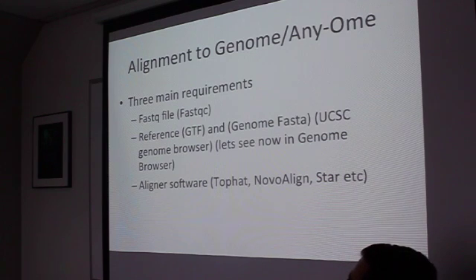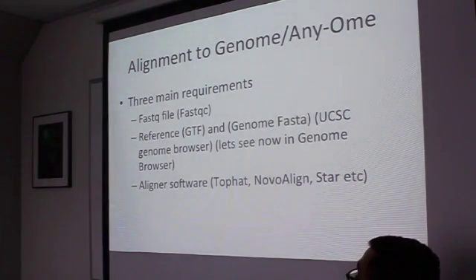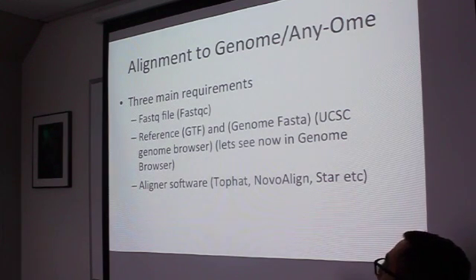Okay, so the next step is the aligners. We have these alignment software packages. There's the TopHat suite, there's NovoAlign, there's the STAR aligner.